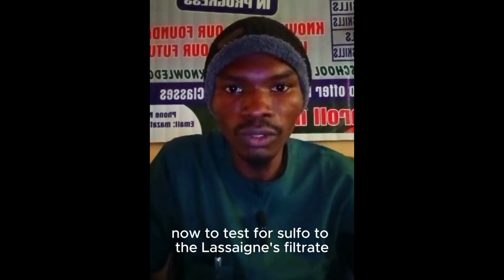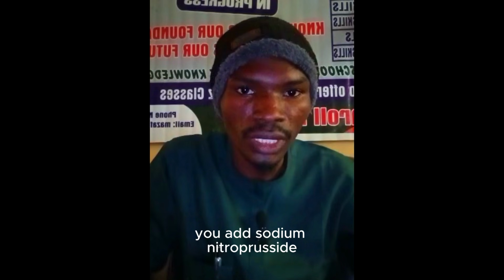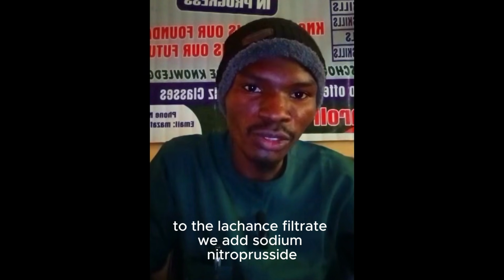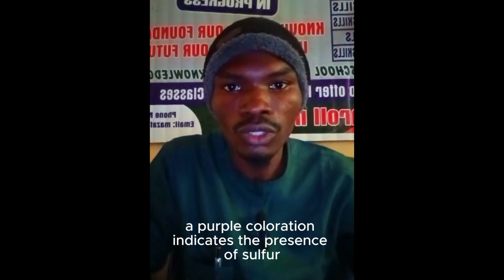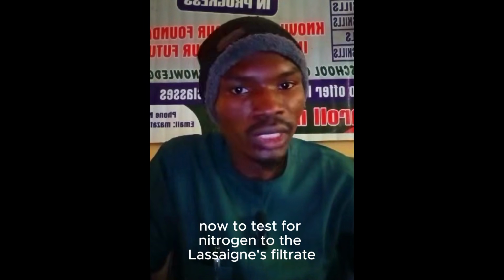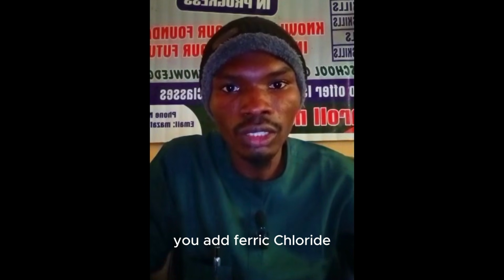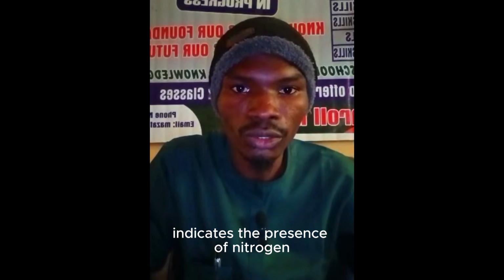Now, to test for sulfur, to the Lassaigne filtrate, you add sodium nitroprusside. A purple coloration indicates the presence of sulfur. Now, to test for nitrogen, to the Lassaigne filtrate, you add ferric chloride. A Prussian blue coloration indicates the presence of nitrogen.